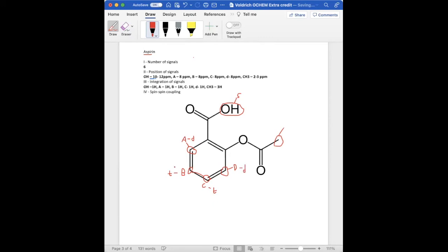Again, all 4 of these may have some coupling interactions that cause it to have different looking peaks, and also sometimes in NMR, our peaks are not very precise if the instrument is not correctly set up or used. And so therefore it may not always appear that they are doublets or triplets. However, we can determine based on the shift, if not, and the integration, if we're given the integration.